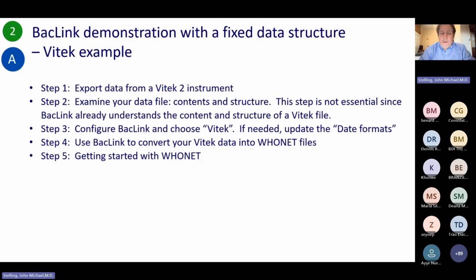So step three, configuration. Step four, convert your data file manually once a week, once a month, once a quarter, once a year, and then get started with WHONET. So this is the same slide as the previous one, but more specific for Vitek.